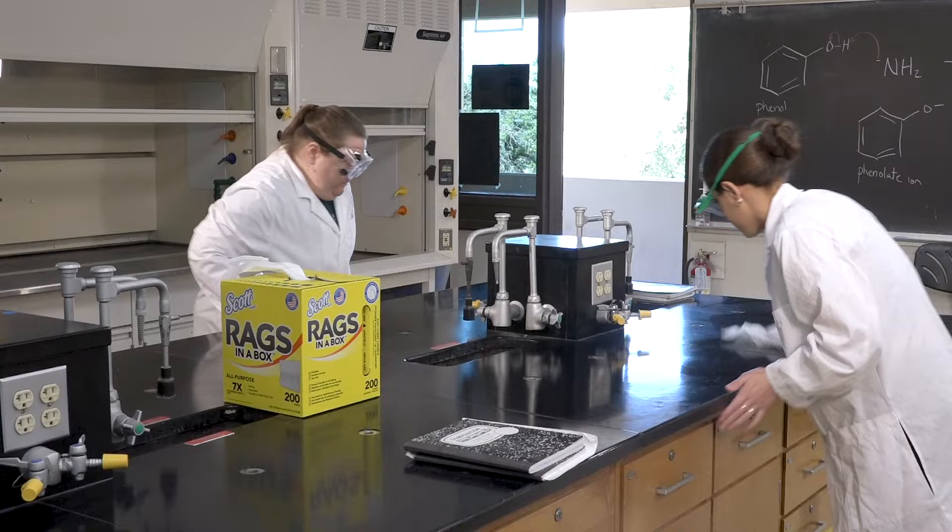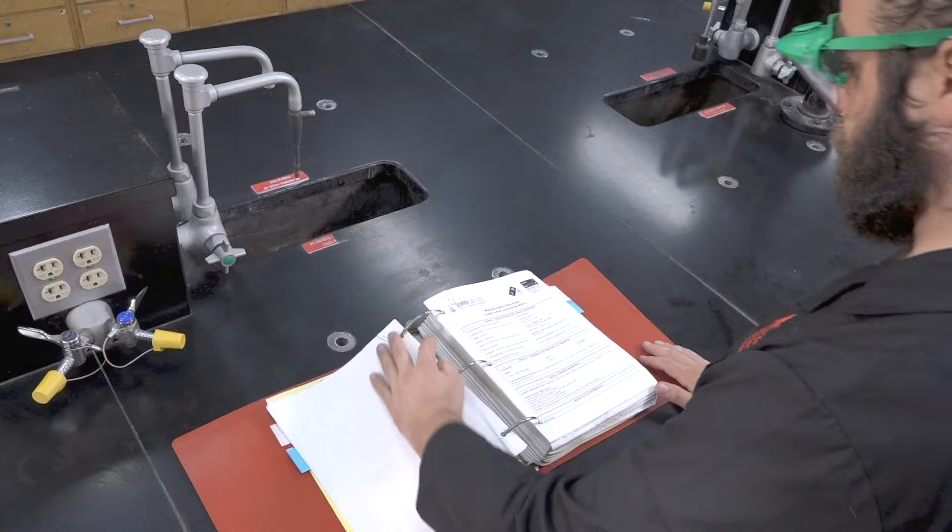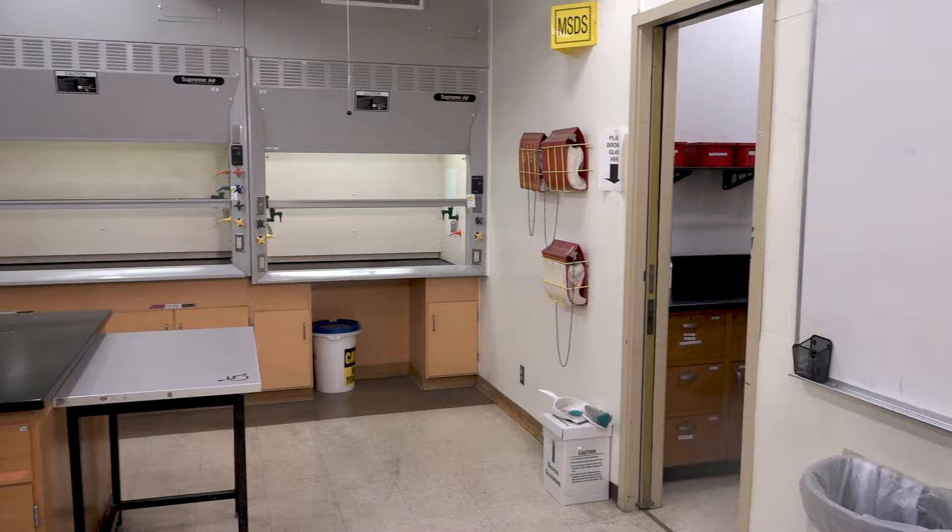Information on the chemicals being used, including the hazards associated with those chemicals, can be found listed in the Materials and Safety Data Sheet, or MSDS. These can be found in a binder located at the back of each classroom.